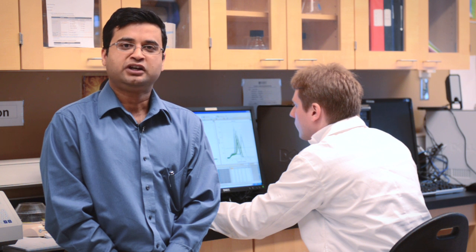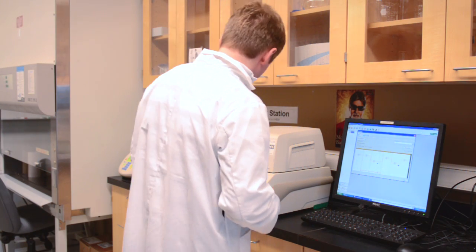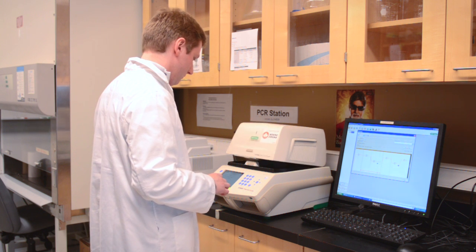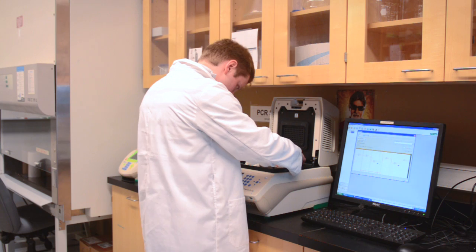In another project we are studying the environmental conditions that impact the expression of multidrug resistance proteins in Acinetobacter baumanii. We use QRT techniques to measure the expression of these proteins under different environmental conditions.